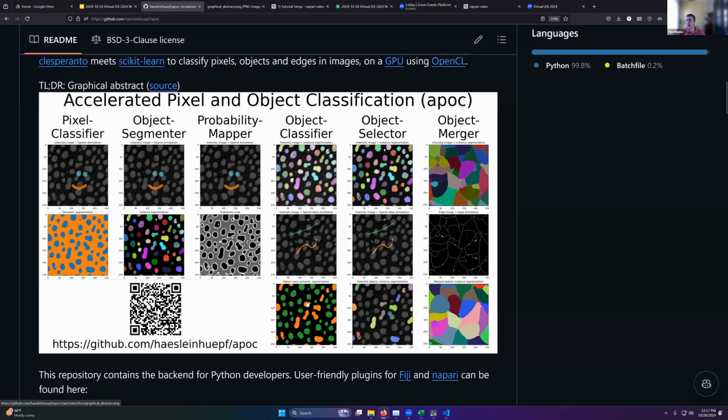And it's really neat. I currently use this in my own work to identify, in whole well images of the nuclei stain, whether that's DAPI or Hoechst or something, to count the number of dead and alive cells, because we can quite easily segment DAPI, and then dead and live cells are very different. And so we can use this object classification to screen really quickly how many cells we have that are alive. It also means for my single cell neuron stuff that I can actually get rid of cells that maybe have multiple nuclei or have dead nuclei, because we don't want to quantify those when we're trying to consider live cells. So you always kind of have to be thinking about what analysis you want to do.